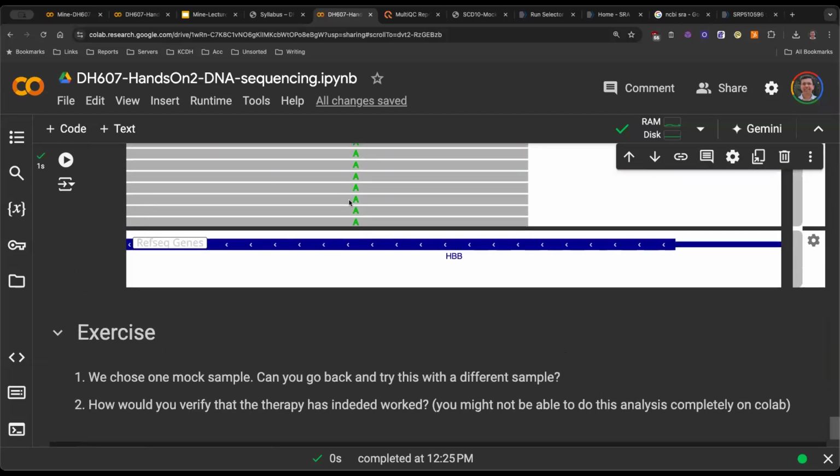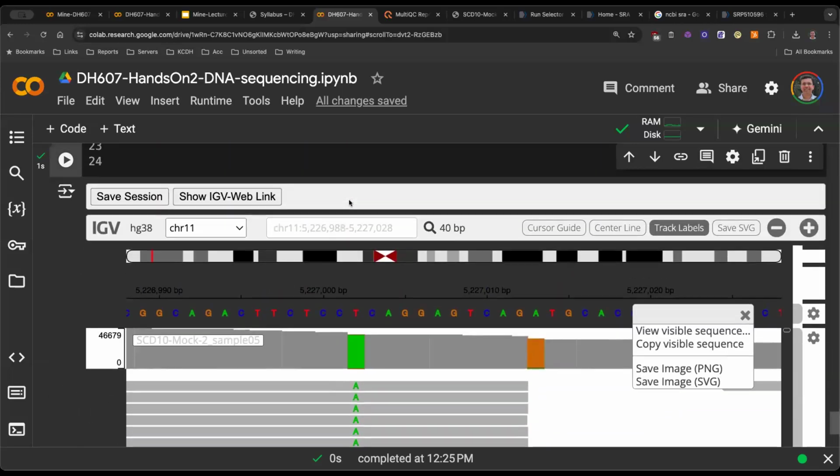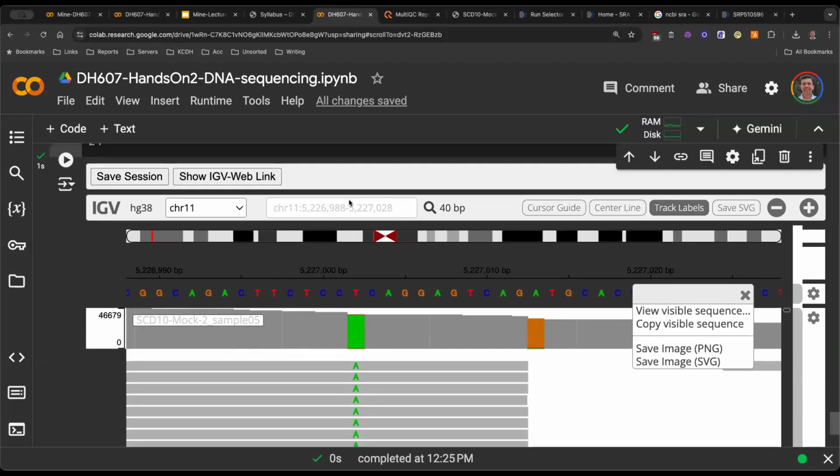And this A is what then? T. Okay. Slightly counterintuitive, but not difficult to understand if you understand what is happening here. The gene reads in this direction. The sequences that you're seeing all use this forward direction as the reference. That's why everything is flipped in this case. So it's slightly unfortunate that I could not show you the A to T, but this is the A to T mutation that we have in the data, right?